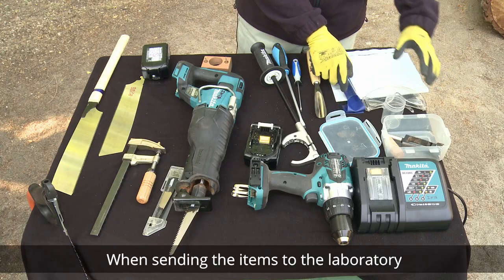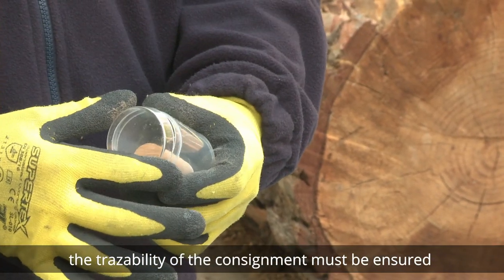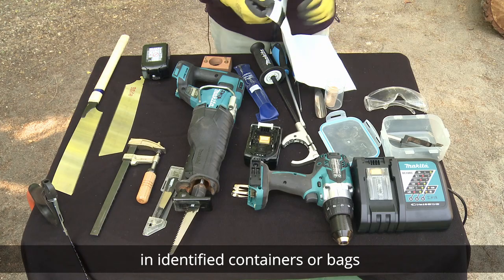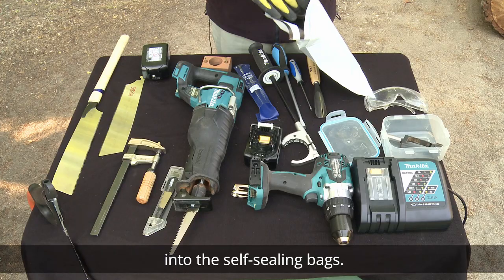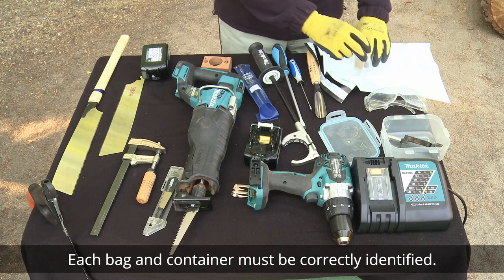When sending the items to the laboratory, the traceability of the consignment must be ensured. For this purpose, place the wooden stoppers in identified containers or bags, and then in sealable bags. All other parts may be placed directly into the self-sealing bags. Each bag and container must be correctly identified.